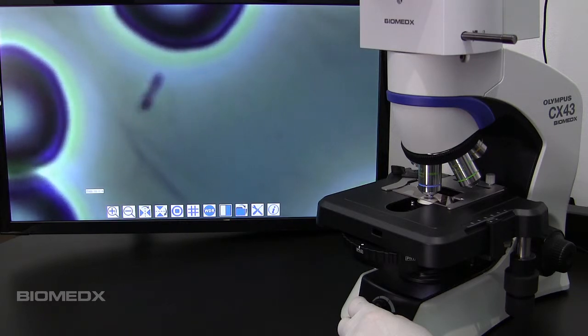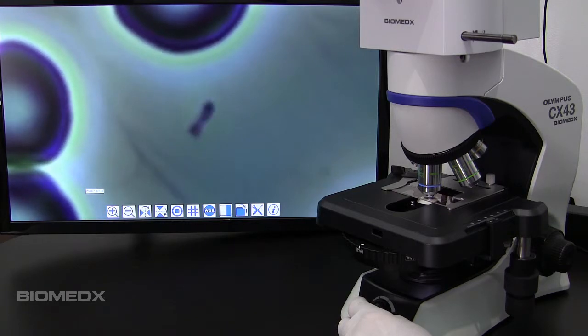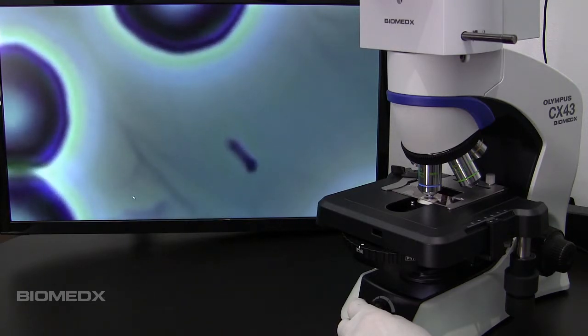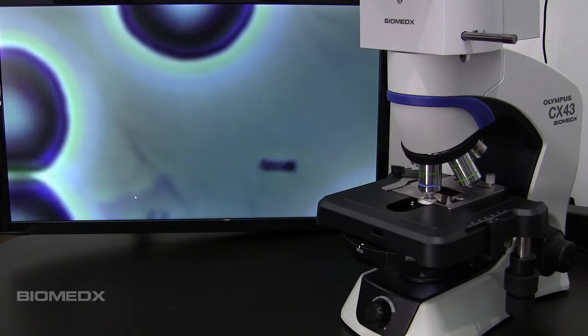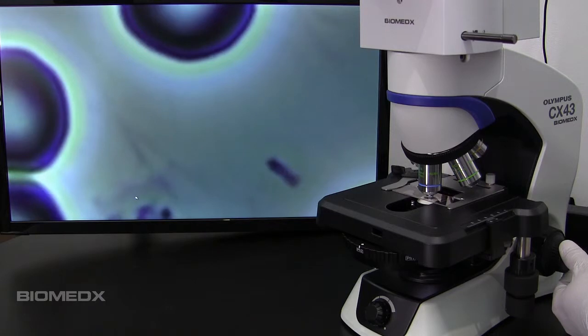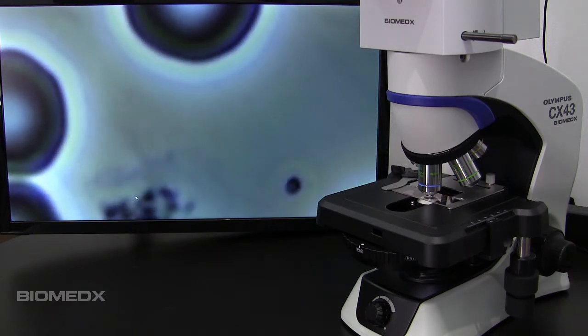Now this zoom image is all done digitally. We are only using a 40x objective and it is all non-oil. That little bugger is well under a micron in size diameter. Red blood cells you see are 7.5 to 8 microns in diameter so probably that is 500 to 700 nanometers.